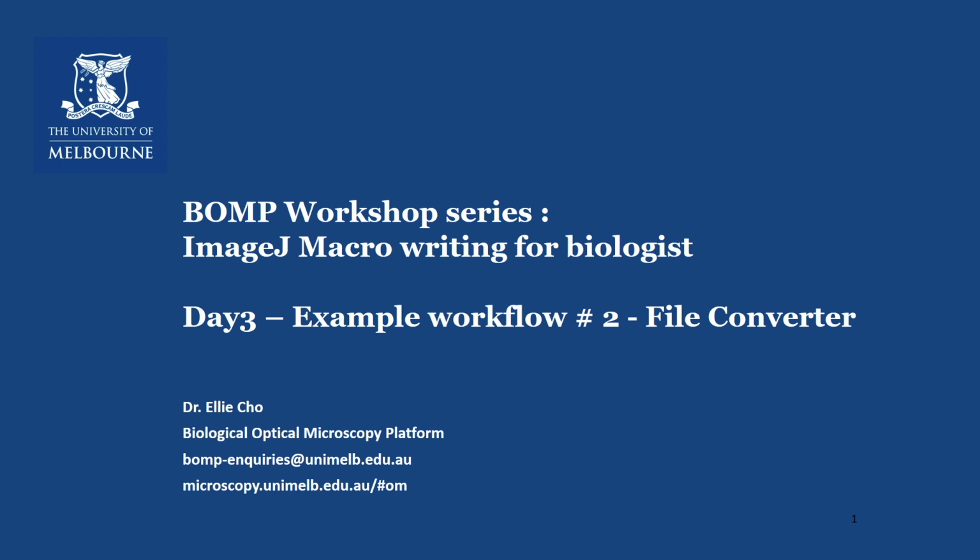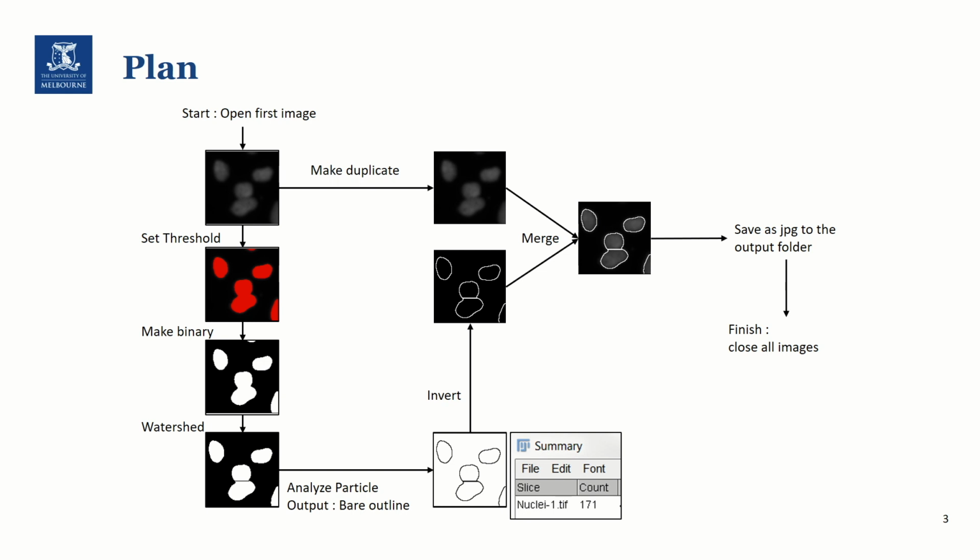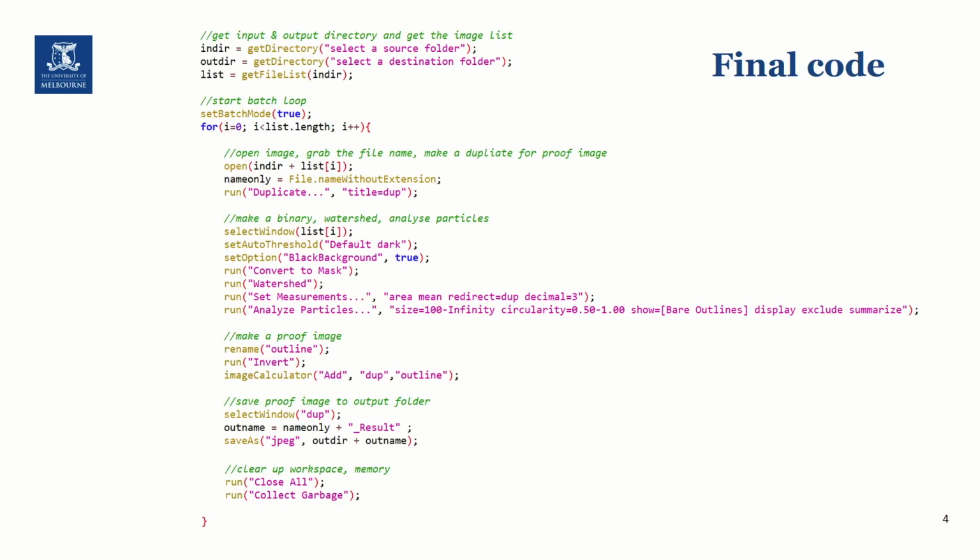Welcome back to day 3. Just a quick recap on the activities from day 2. We have written a complete batch analysis script doing cell counting using loop and array.